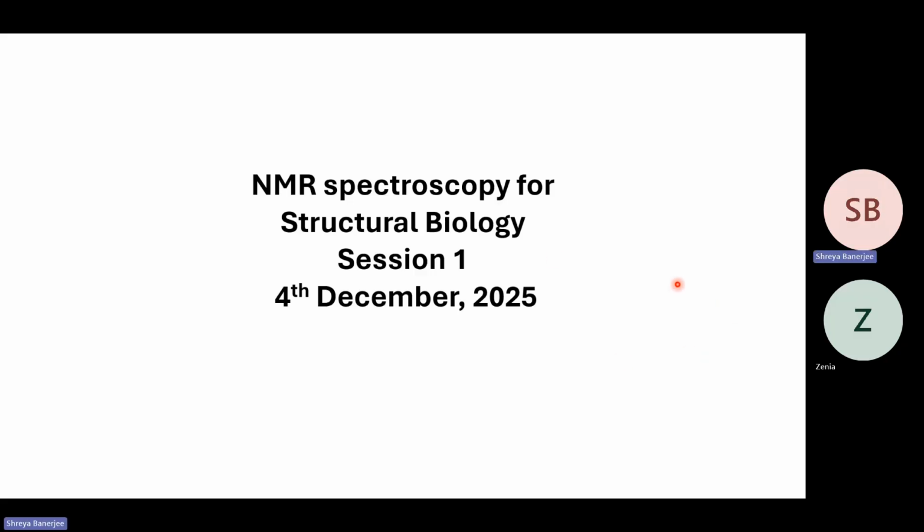So this class is the NMR spectroscopy for structural biology. I will be taking 5 classes, 2 hours each, and all the sessions will be recorded and uploaded. So even if you're not in the class, you can see the recordings, and then in the next class, you can discuss any doubts that you have. So the first class will mostly be about the basics of NMR spectroscopy.